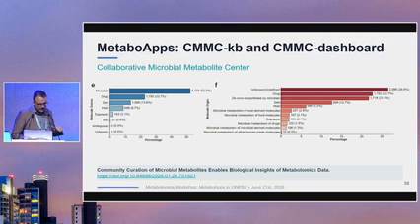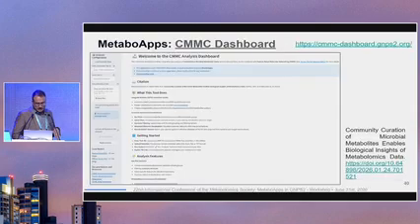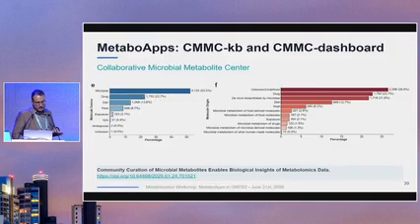So right now that's the overview of what we have on the knowledge base. So basically, you have 4,000 microbial molecules, almost 2,000 drugs, diets, host, exposure information. And some of those are still ambiguous, that we don't have enough information to be classified as something more specific.